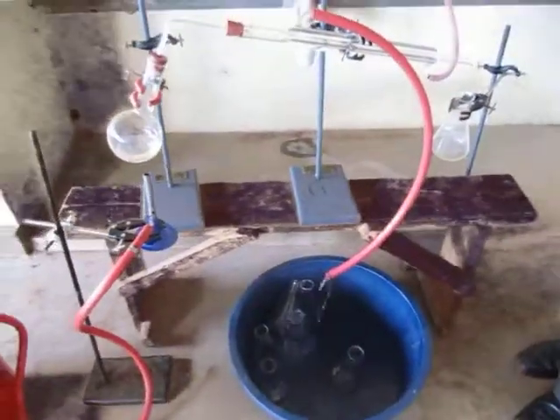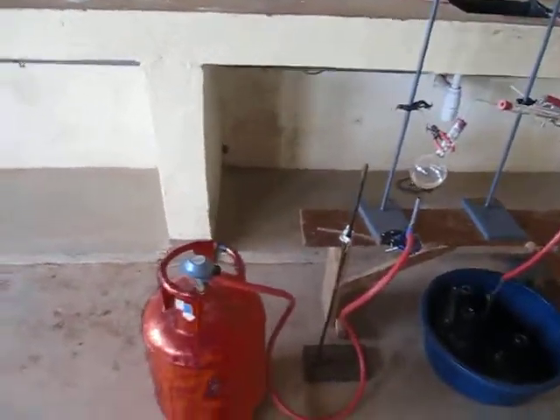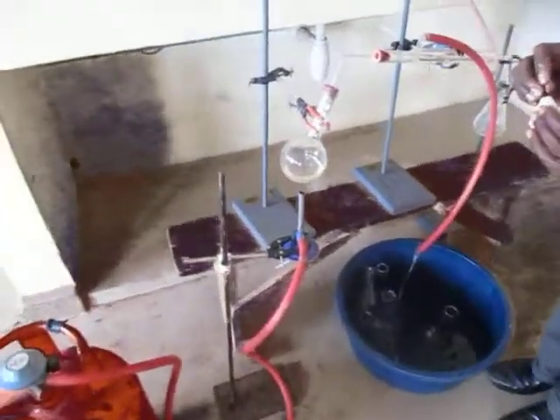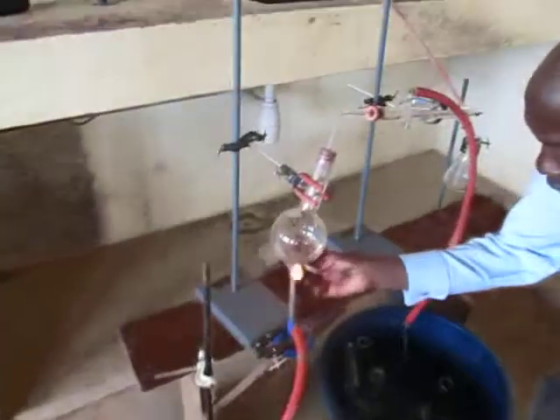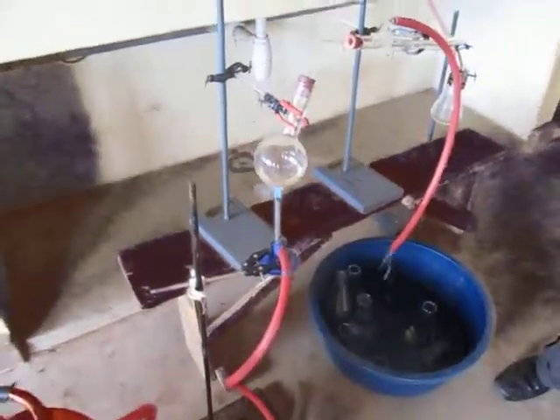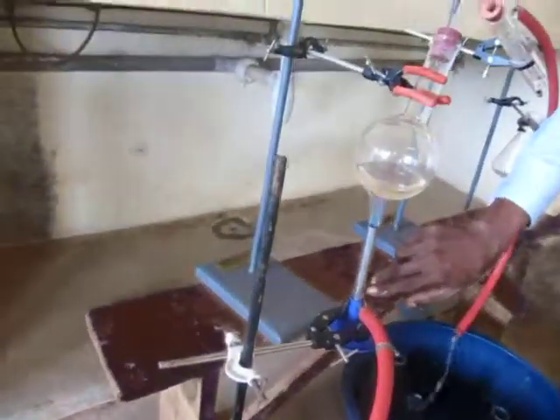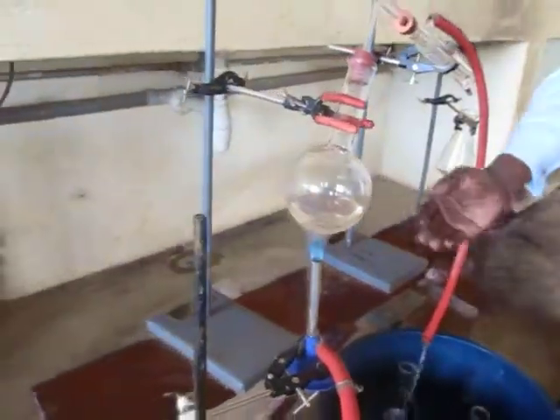So now we heat, or we light the burner. To remind you the process of lighting the burner, first you get the matchstick burning, turn on the gas and light the burner. Already the air hole is fully open so that we get a non-luminous flame which is hotter. So now the mixture is being heated. I want you to observe what happens here.